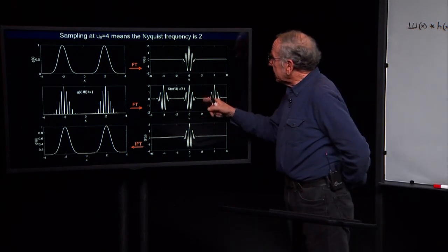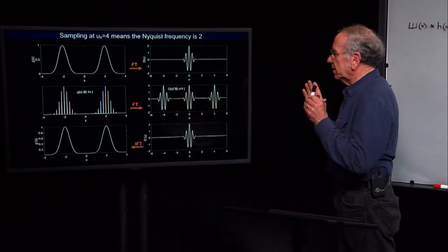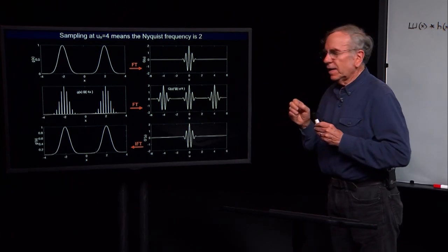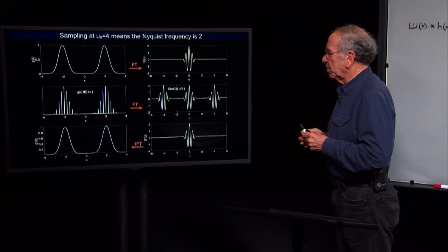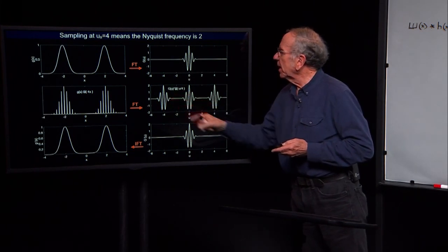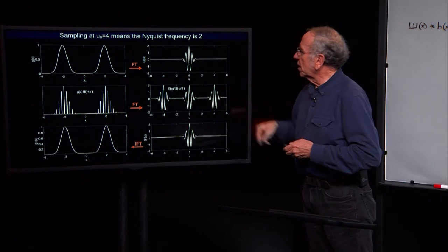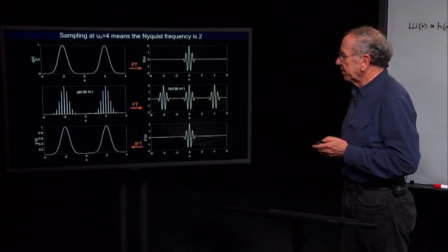So in this case, the relevant values are U equals 2 and U equals minus 2. These are critical sampling rates such that we can make essentially perfect reconstruction of our sampled function. And if I sample too slowly, I cannot make a perfect reconstruction because I have overlap between these two copies of the Fourier transform, and hence we get errors.